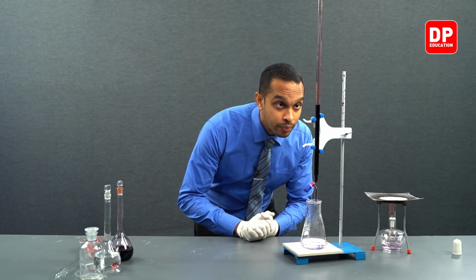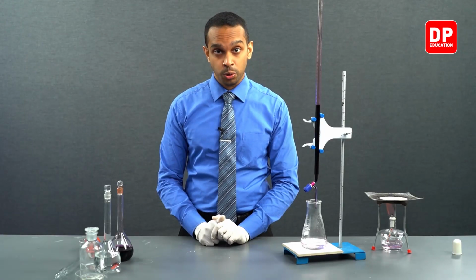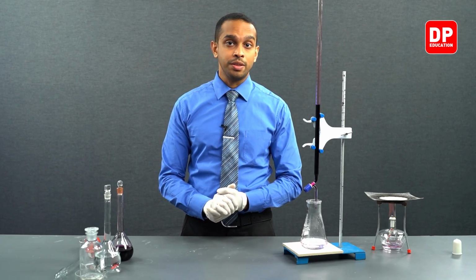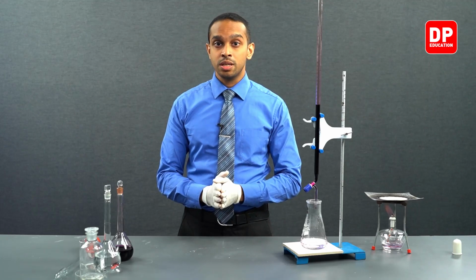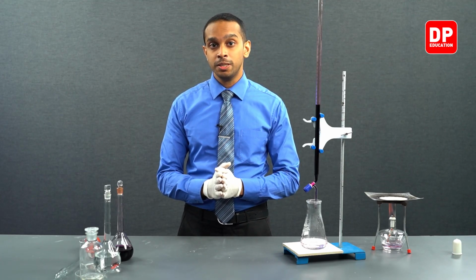So the burette reading at this point is exactly 31.5. We are not at 31.6, but 31.5 is still a concordant burette reading, because the previous two burette readings were 31.6. Both first and the second titration was 31.6, and the third one was 31.5, which is quite a precise set of burette readings that we have obtained.